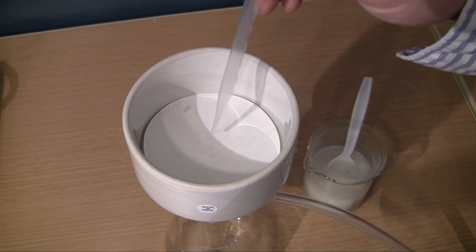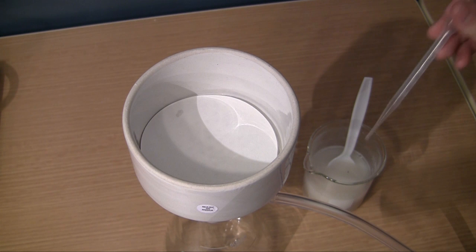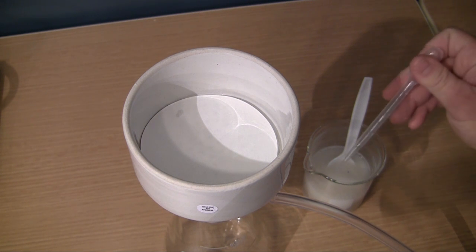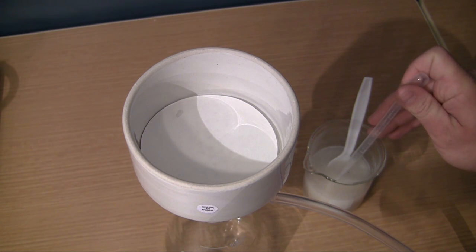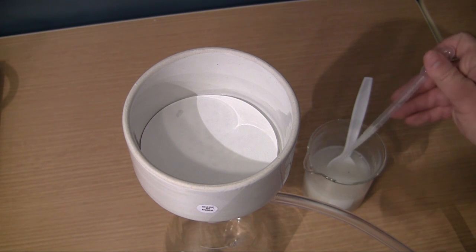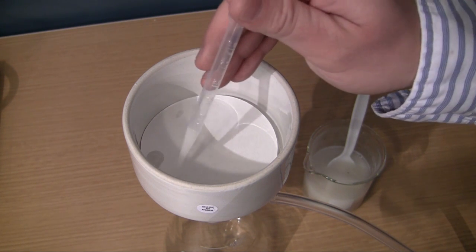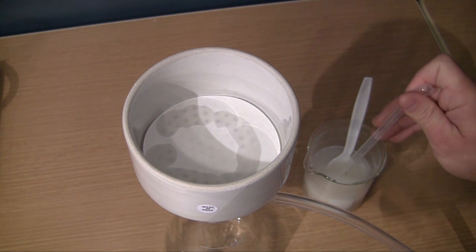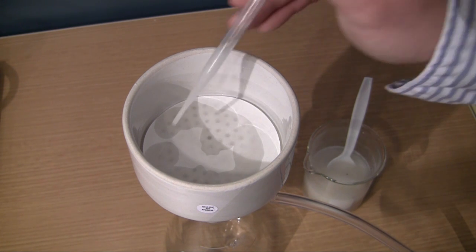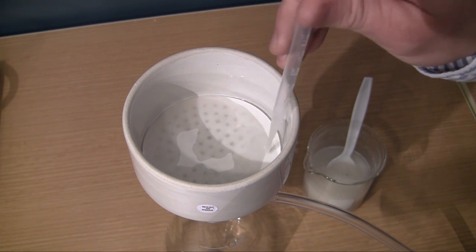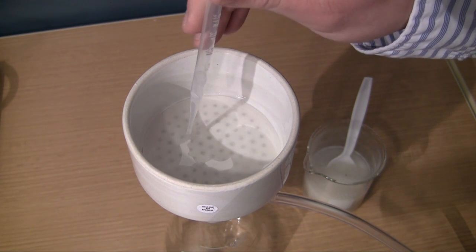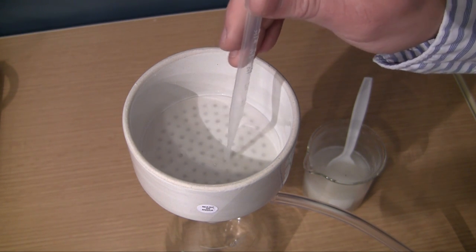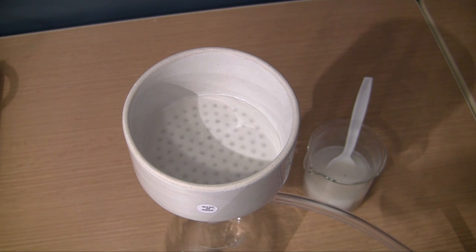So in order to make this paper stick to the funnel a little bit better before we start pouring our mixture in, just go ahead and grab a little water. And as you can see, whenever I pour it on the filter paper right here, it's going to make that paper stick to the funnel and make a real good seal. And this doesn't mess up your experiment at all because this water is actually part of the mixture itself.